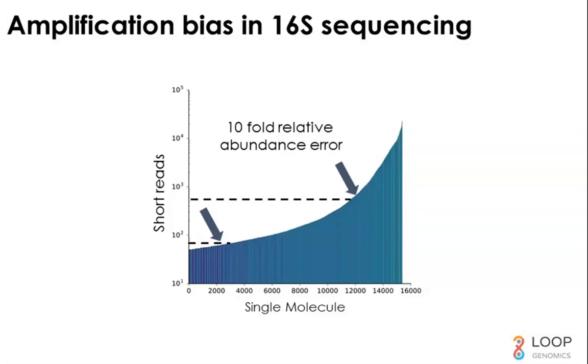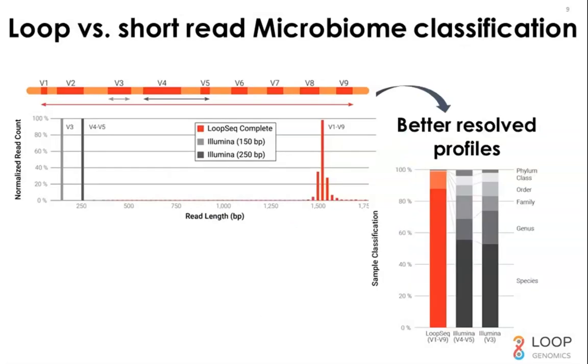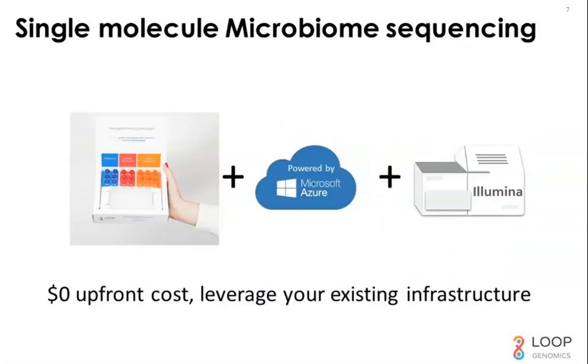Okay, great. And does the ability to resolve closely related 16S sequences depend on the stringency with which you reassemble the LoopSeq reads? Our assembly of the LoopSeq reads is completely independent of the downstream classification. Whether you're doing reference-based classification or OTU analysis, the assembly of the long reads is done completely de novo and is reference-free.